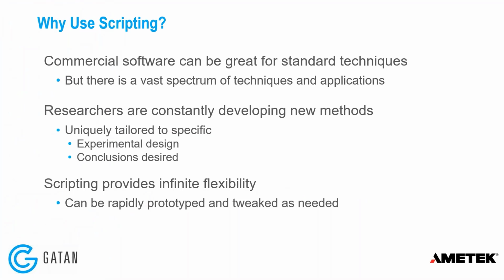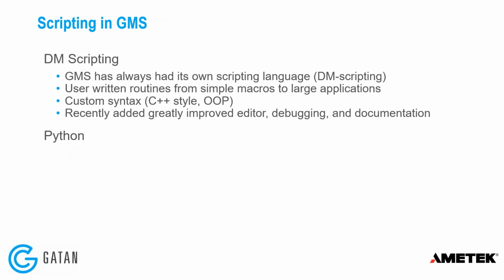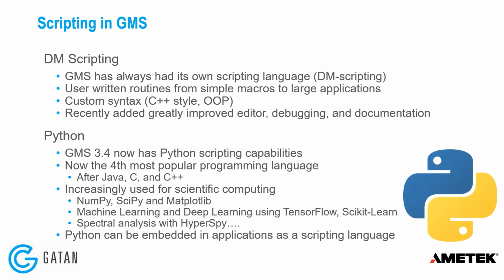And just say that scripting really provides infinite flexibility to do any type of processing or analysis that you want, any type of visualization. So it's really valuable. And recently, Gatan has implemented and integrated Python scripting into our software.